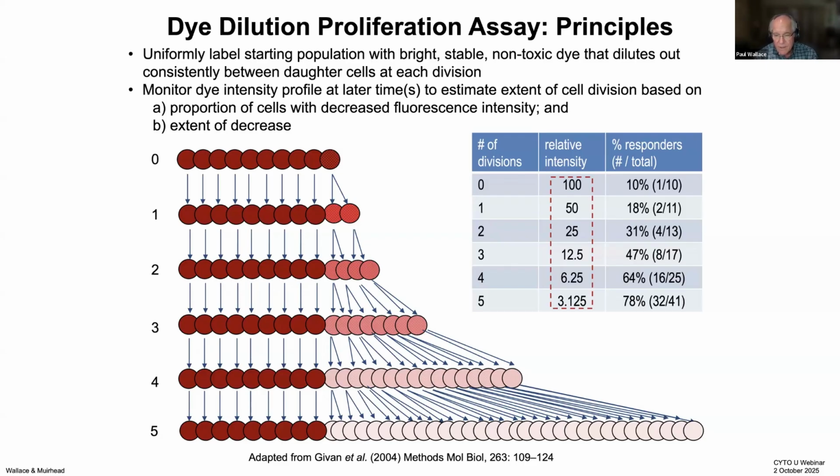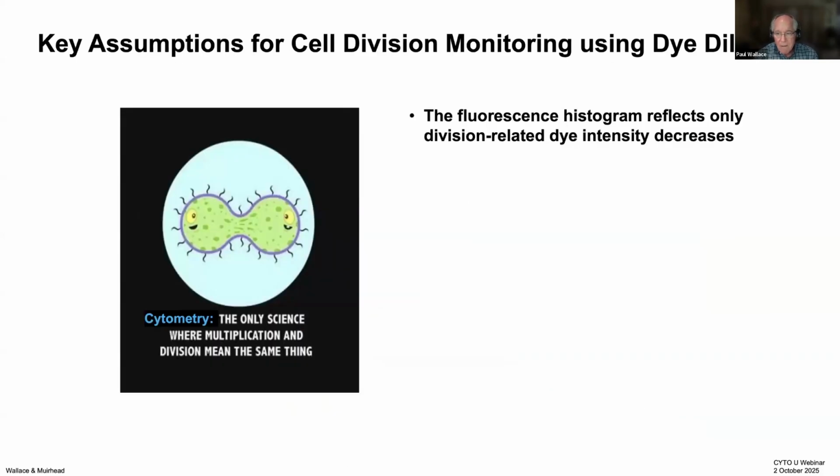The advantages are that proliferation dyes can be combined with antibodies, antigen-specific multimers, or other probes to quantify subsets of interest within a complex population and determine the extent of cell division without having to physically isolate them for counting. Parental and or daughter cells that respond differently to agents that stimulate or inhibit cell division can be physically sorted for further functional and genetic characterization by other methods. Some, but not all, of the dyes used for general cell tracking can also be used to monitor cell division.